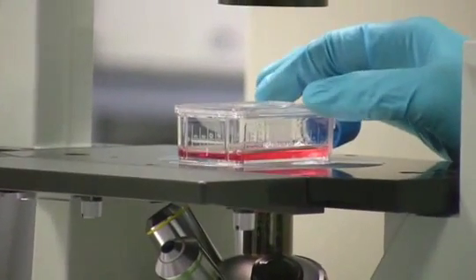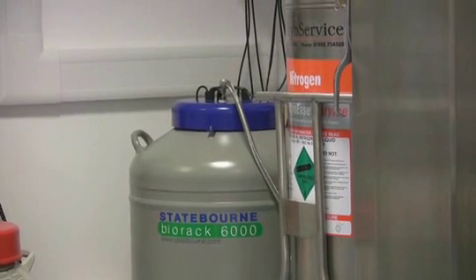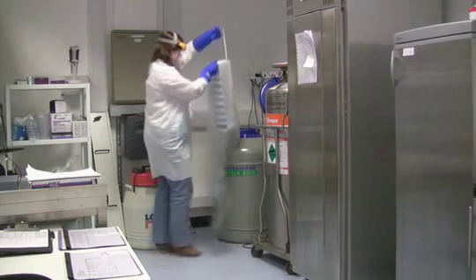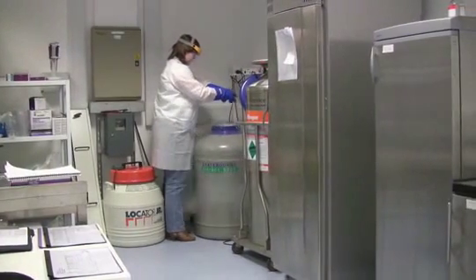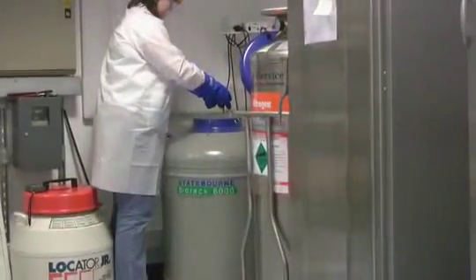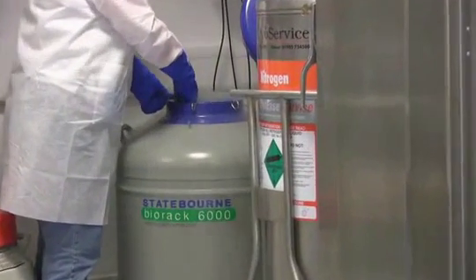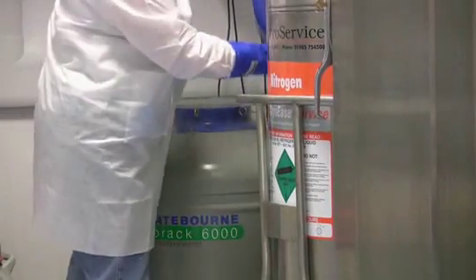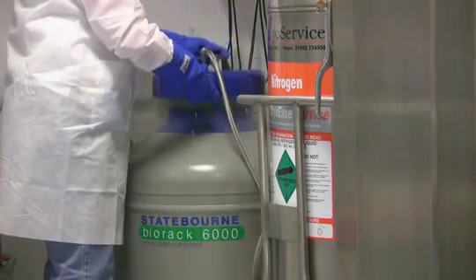Once the cells have grown and are amplified, we store them in liquid nitrogen at minus 190 degrees. We store a minimum of 800,000 cells and these are divided into two. One set of stem cells are stored at our laboratory here in Cheshire. The other set are stored at a remote unconnected site as extra insurance for you and your family.